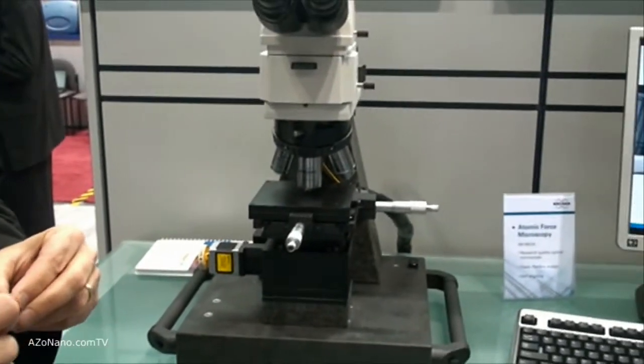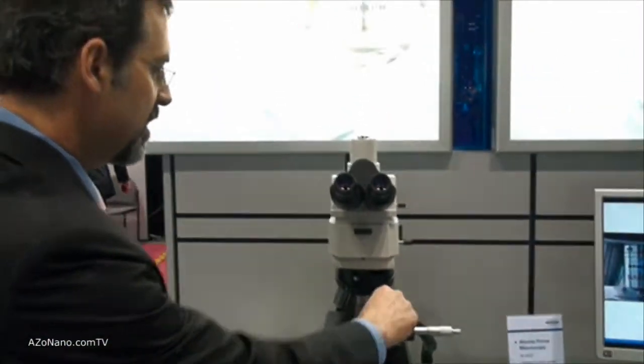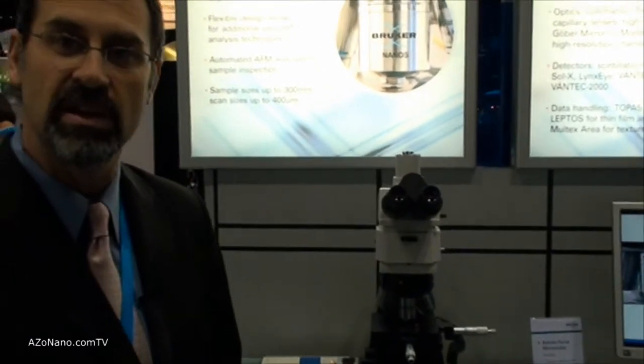We then couple that to the standard piezo, but the bulk of the detector system is down inside the controller.